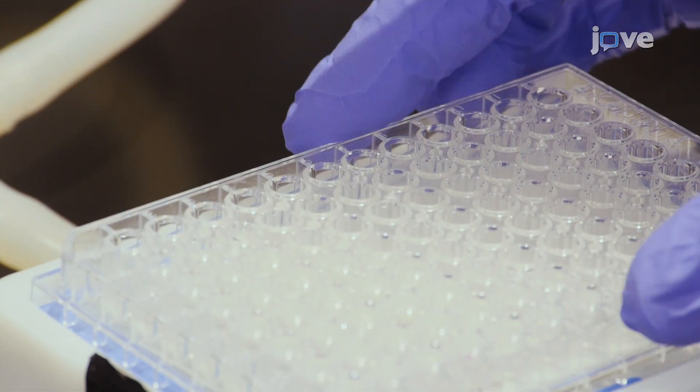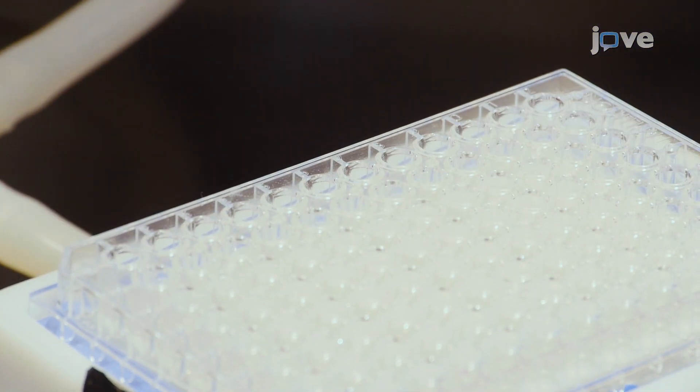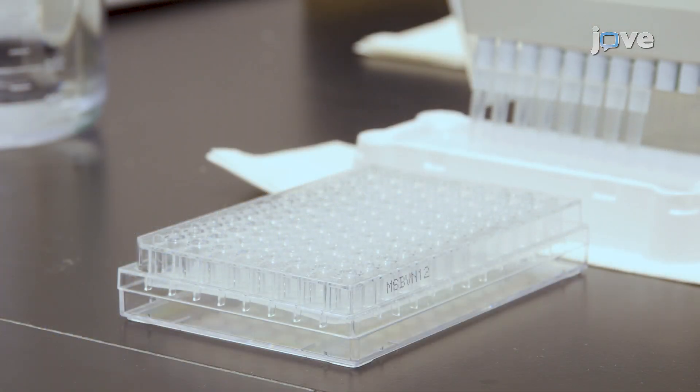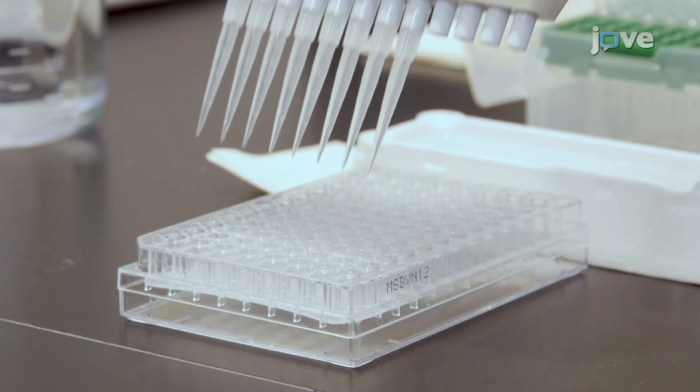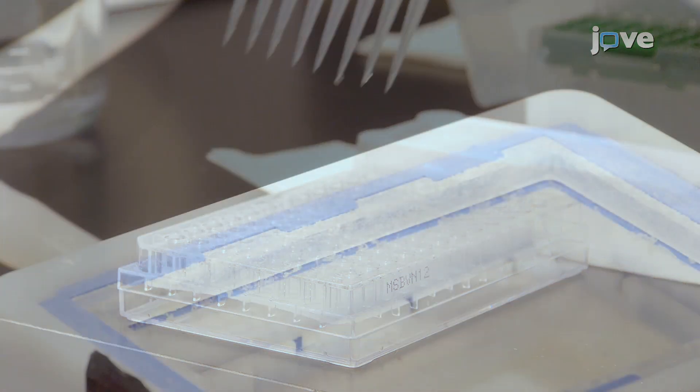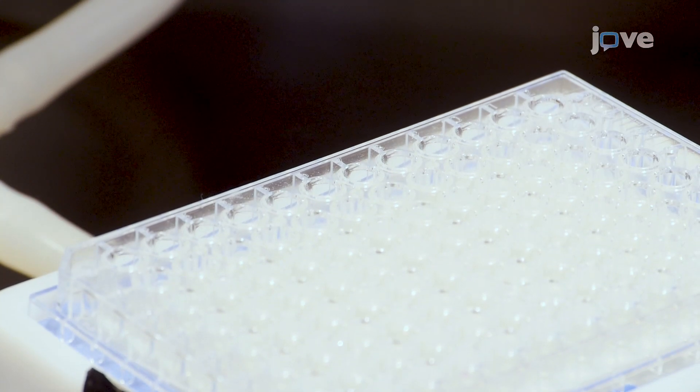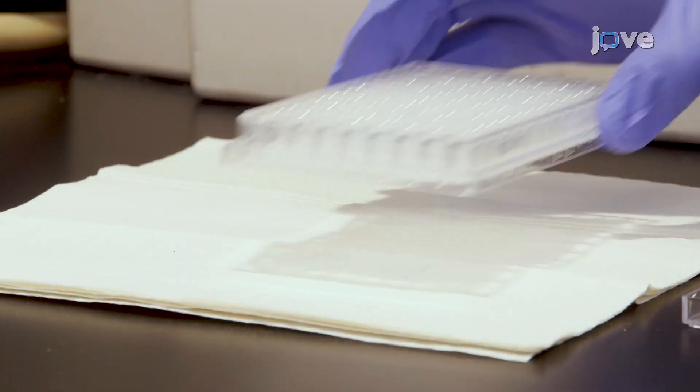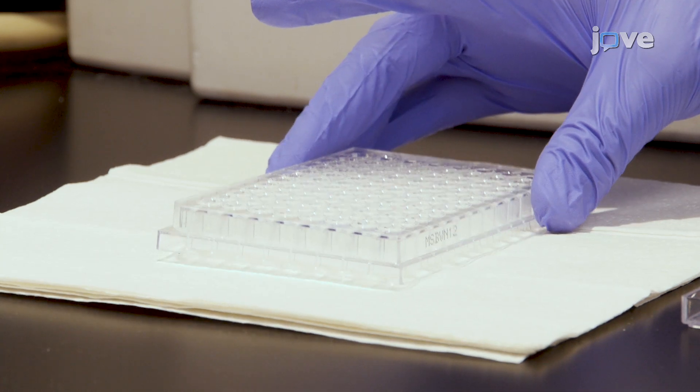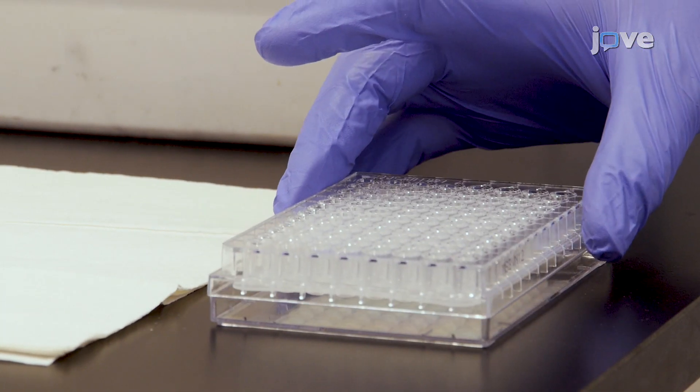Without inverting, place the plate on the vacuum manifold and apply the vacuum as before. Then add 200 microliters of 1x wash buffer to each well. Remove the contents of the assay plate wells by vacuum filtration. Blot excess wash buffer from the bottom of the plate with an absorbent pad or paper towels before repeating this step one more time.